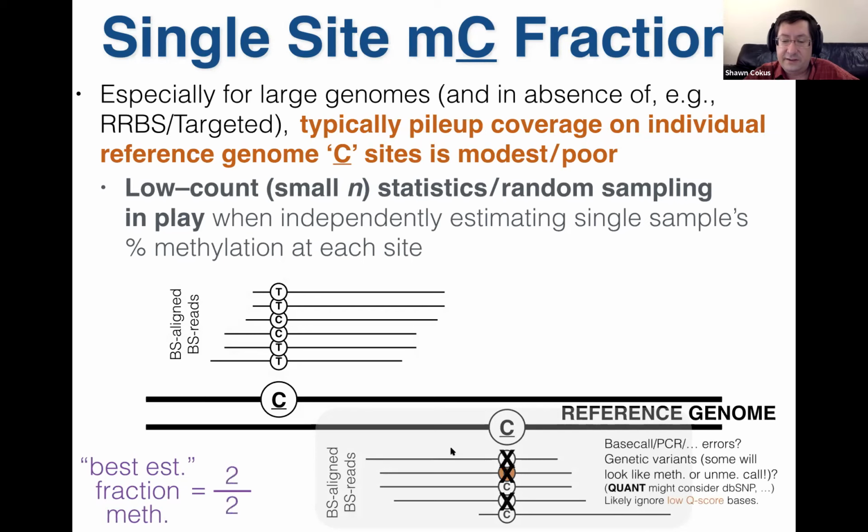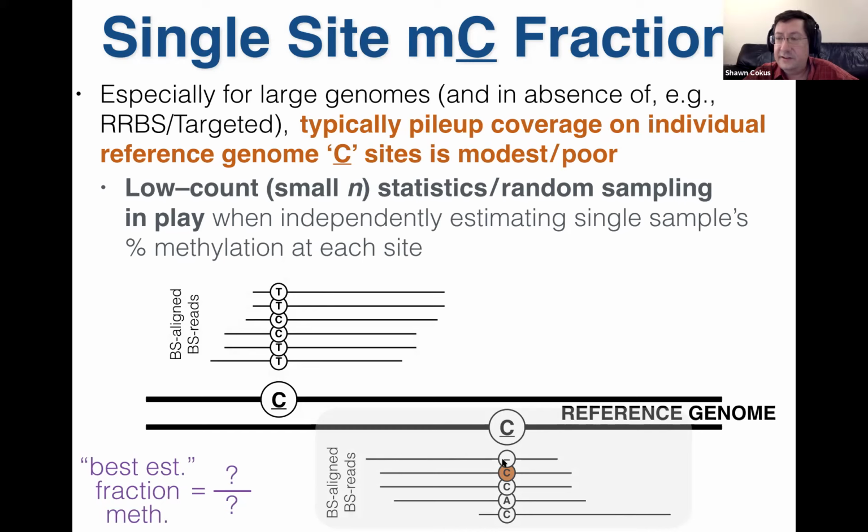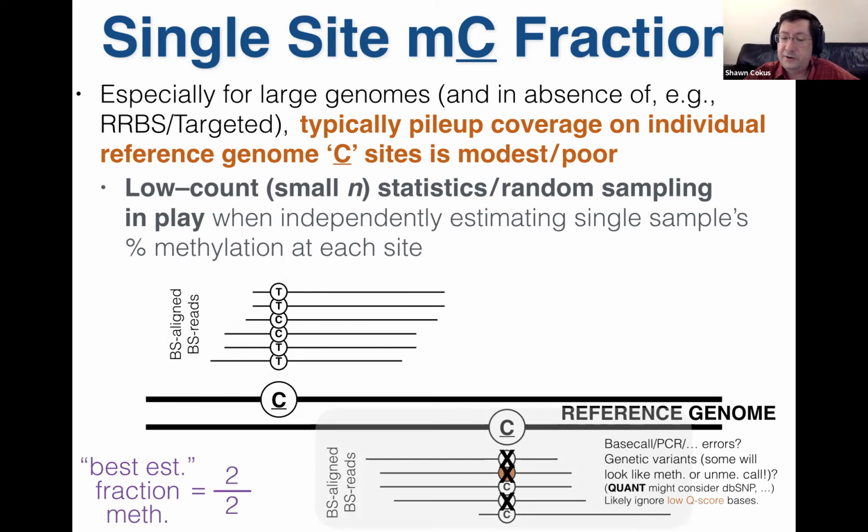We've got a gap in the alignment here at this base. We've got a low quality base call C. We've got a regular good quality base call C. We've got an A, and we've got a regular good quality base call C. Well, we probably throw out the deletion. What do we do? No observation, right?